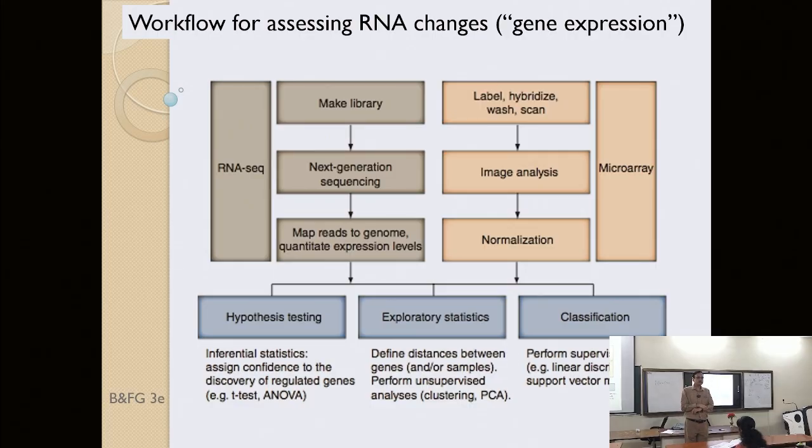So you want to identify which genes have a difference in the abundance of reads between healthy and me. So which have the differences. So for example, a gene may have RNA abundance of say 100 in healthy, and in me 1000.